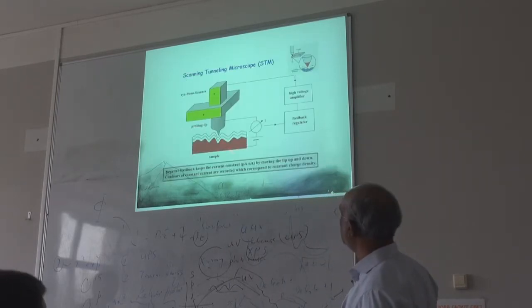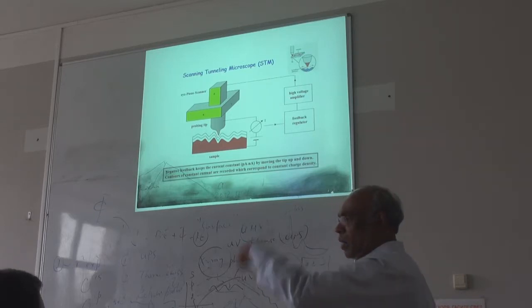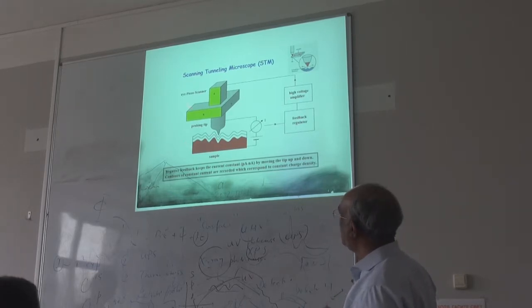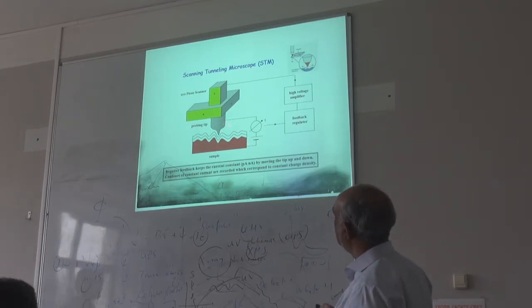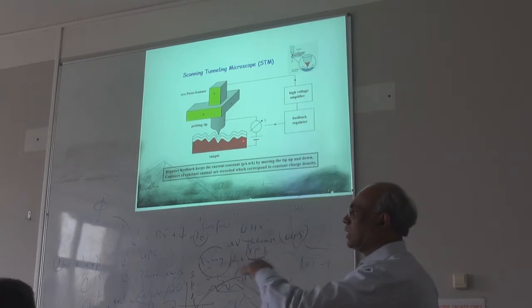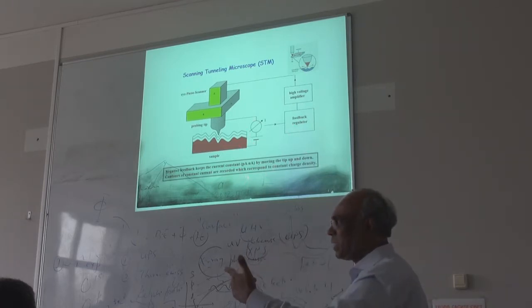You have your sample, then you have a very sharp tip, and you scan this over the sample. An important thing is there is a piezoelectric support here. It always tries to keep the current constant, and for that you need some feedback mechanism.